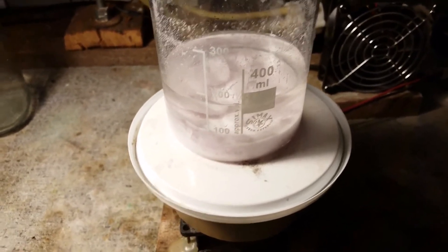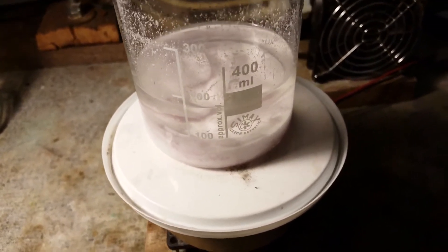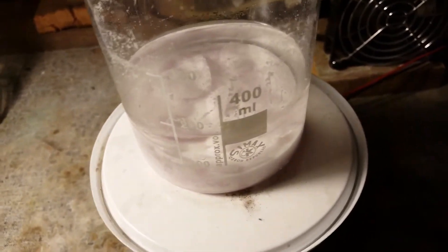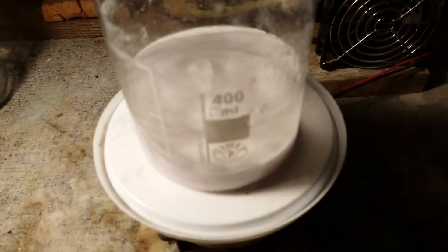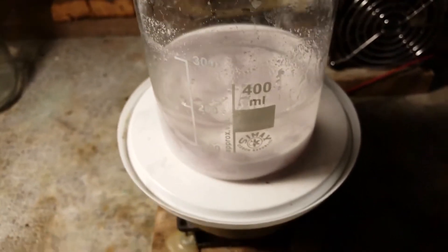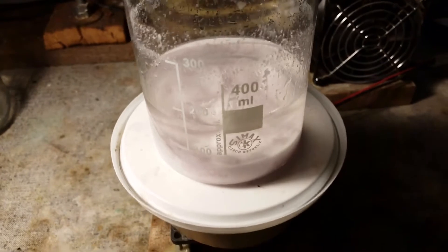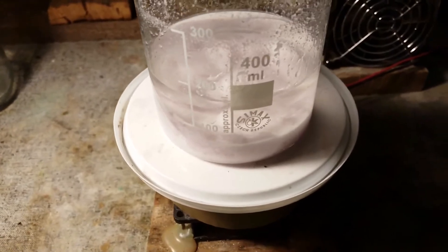The next step is to add sodium carbonate in order to precipitate out the manganese as carbonate. However, there is a slight problem — there might be a bit of an impurity of zinc in this, because the batteries I started with also contain zinc. So along with the sodium carbonate, I'm going to add in some aqueous ammonia. The ammonia will complex the zinc and keep it in solution while the manganese will precipitate.